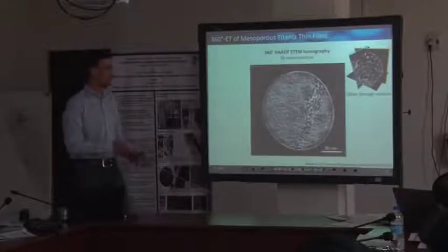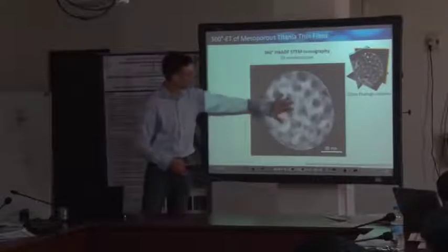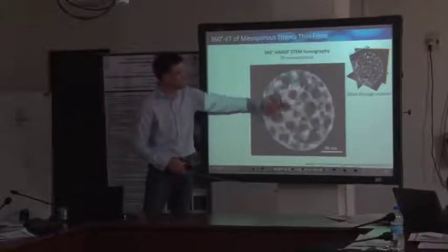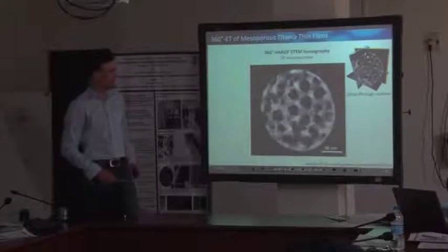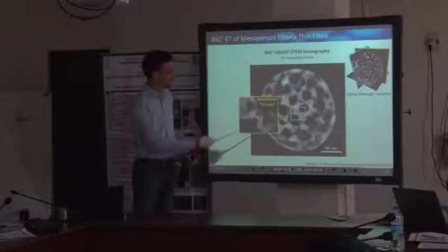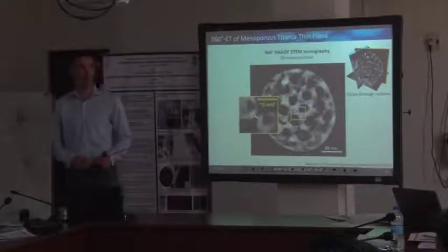This is just after reconstruction, so this is just a fly through the structure from the carbon, through the material, and we finally end up in the silicon wafer. And you see that there are still some intensity variations. The reason for that might be that the titanium oxide is crystalline.